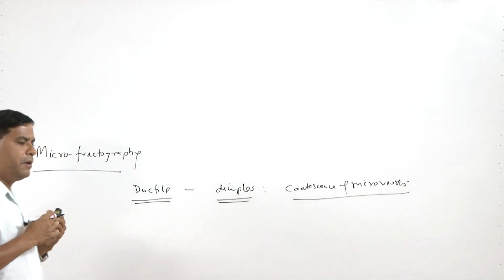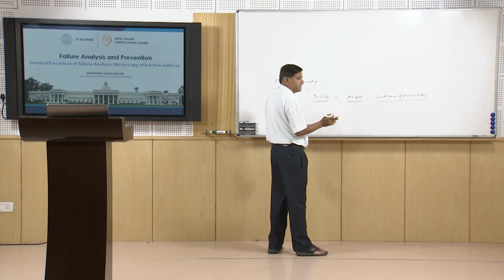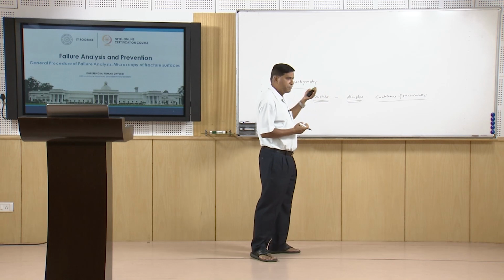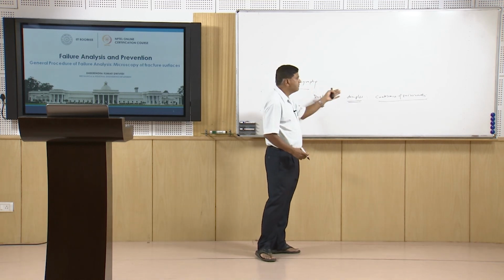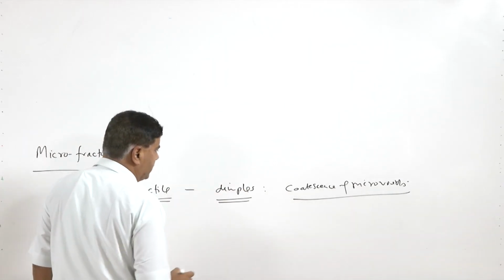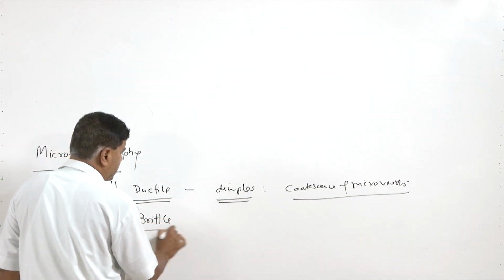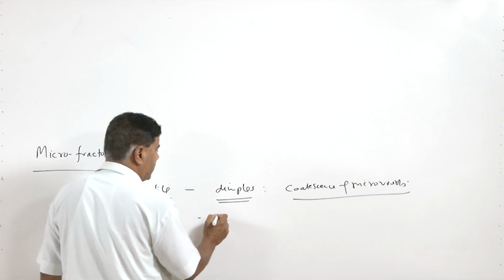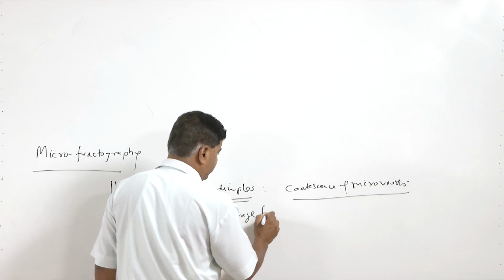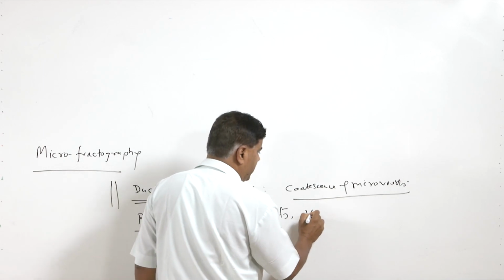This is very general, but in some specialized cases the fracture is brittle, meaning there is no major plastic deformation, but still we see the dimples. But in general, ductile fractures are accompanied with dimples and brittle fractures with other features. Similarly, in brittle fractures, the fracture may occur through different fracture surface features, like cleavage facets, or there can be intergranular fracture.